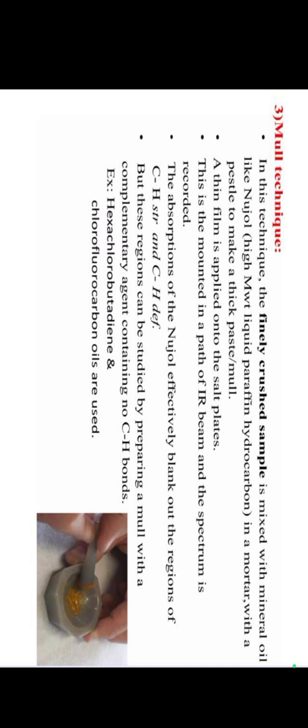The third technique of sample handling for solids is the mull technique. In this technique, the finely crushed sample is mixed with mineral oil like Nujol in a mortar with a pestle to make a thick paste. The thin film is applied on the salt plate. This is mounted in the path of the IR beam and the spectrum is recorded.